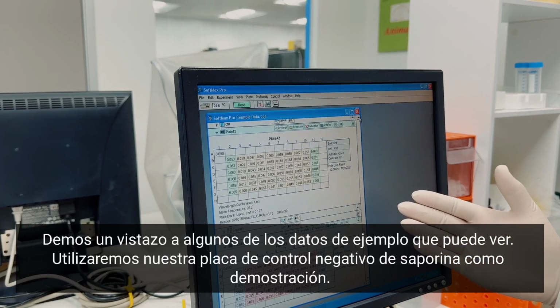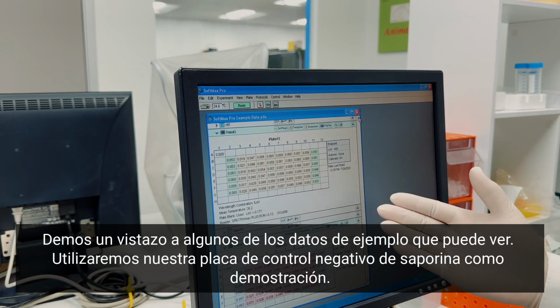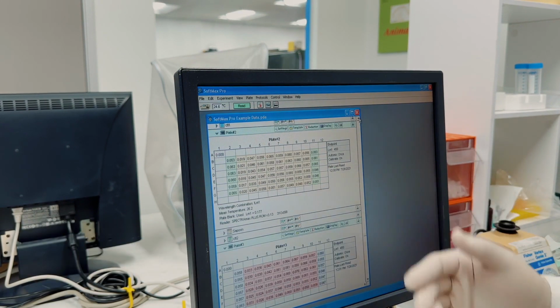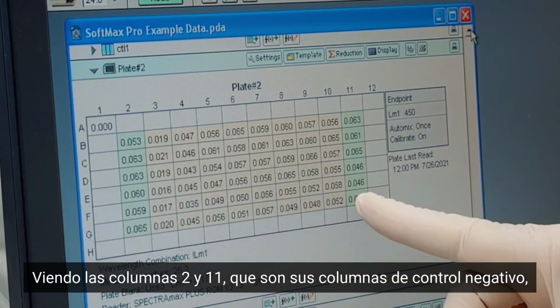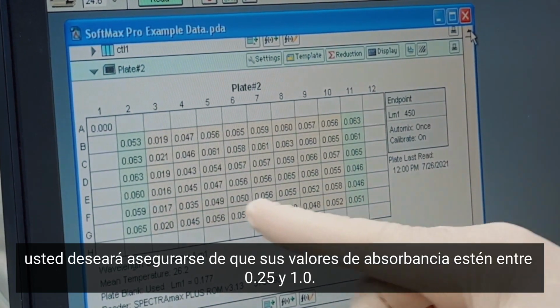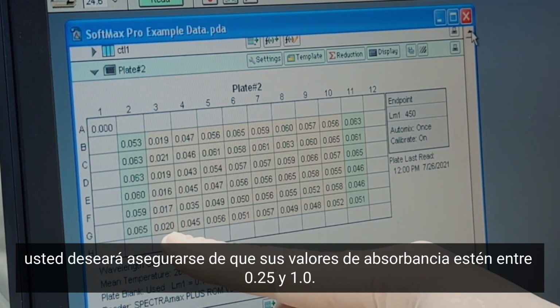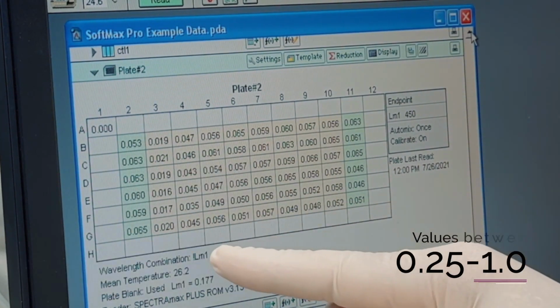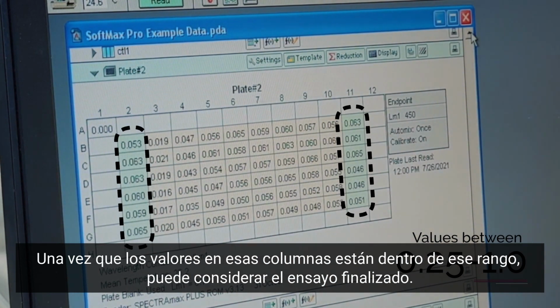So why don't we take a look at some of the example data that you might see. We'll use our SAPR negative control plate as a demonstration. Looking at columns 2 and 11, which are your negative control columns, you'll want to make sure that the absorbance values are between 0.25 and 1.0. Once the values in those columns are within that range, you can consider the assay complete.